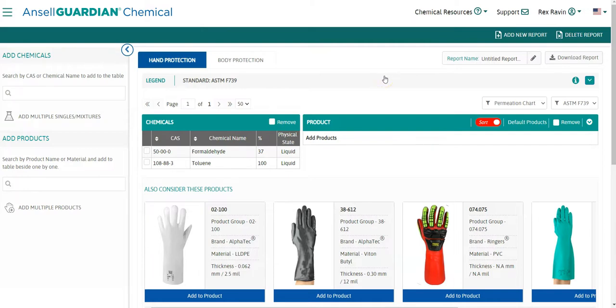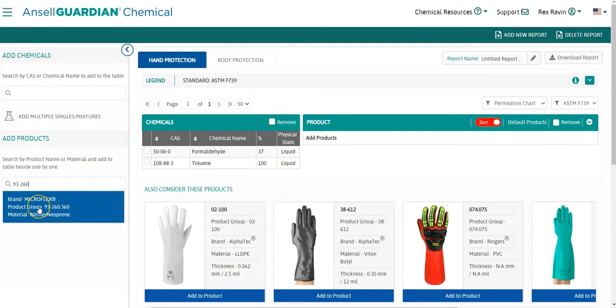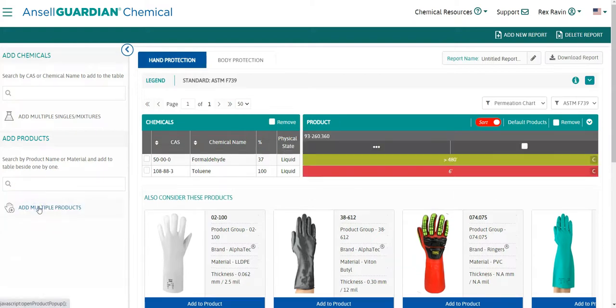To create your own list of products and search for Ansell products, you do that by going to Add Products. So let's search for product 93-260. And I'm going to select that. And now you'll see that product was added here to the table. And now let's add product 53-001. And now you can see what your table looks like at the moment.